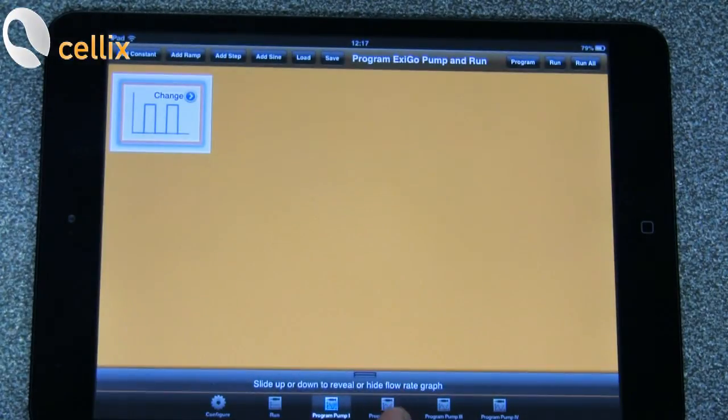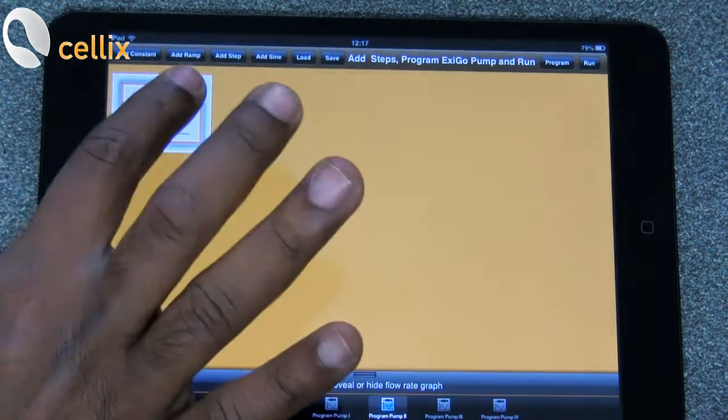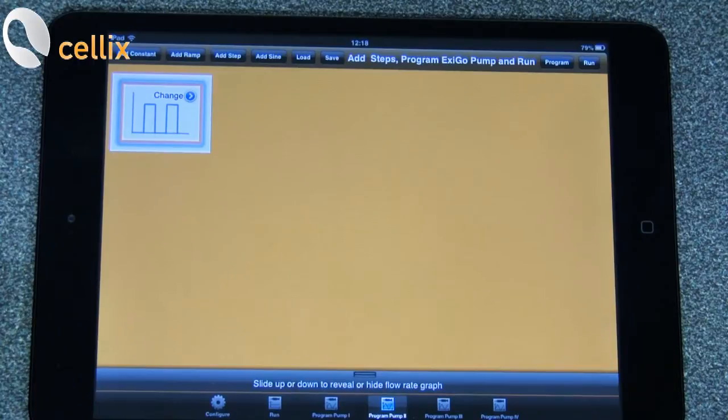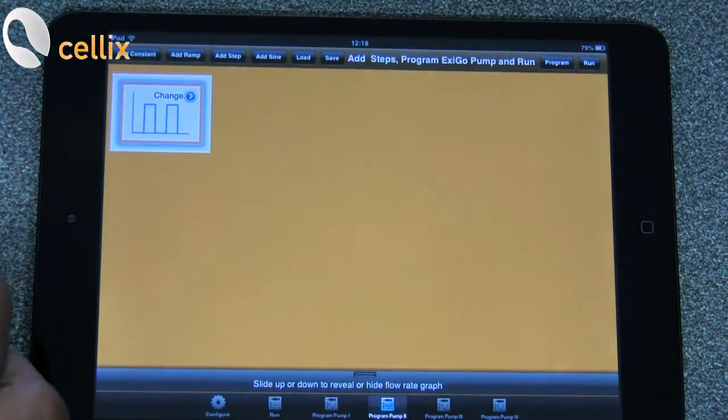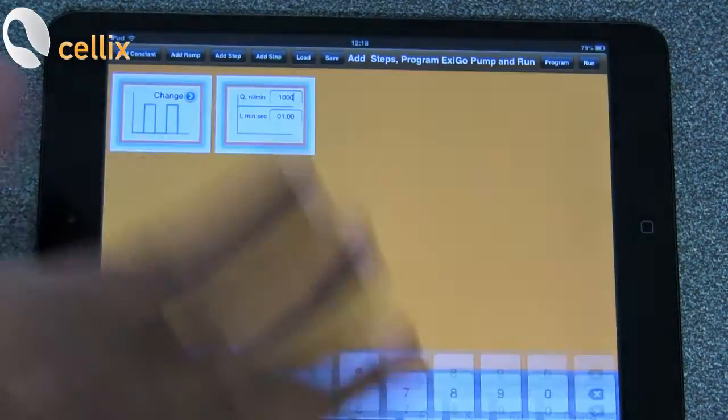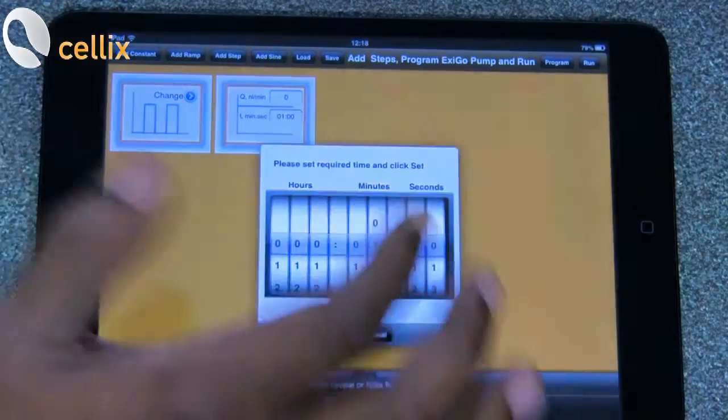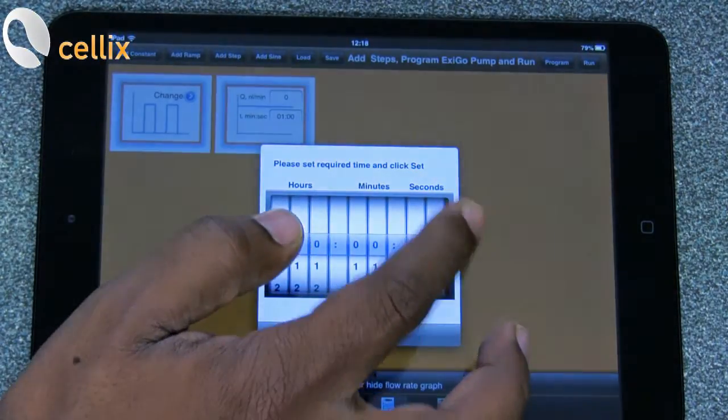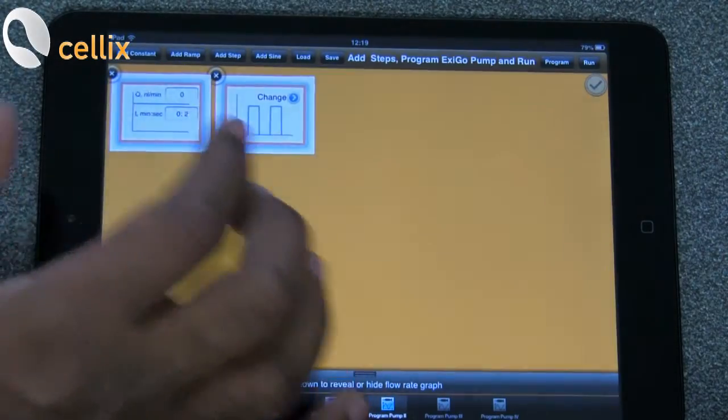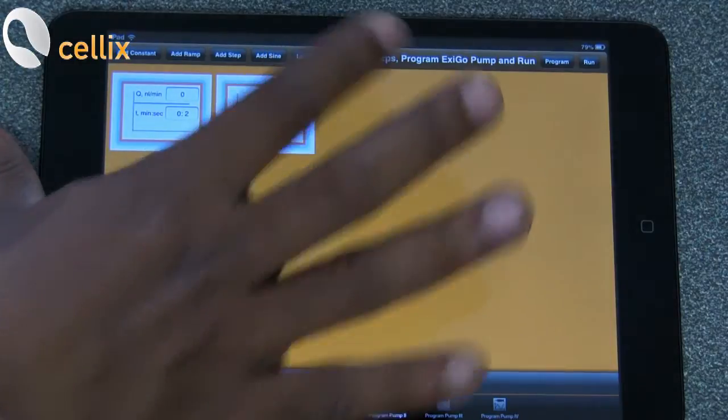And to program the second pump, you go to second pump, you click load. So you have the same parameters there. Since the second pump needs to have a delay of 2 seconds, you have the option for add constant flow where you put 0 nanoliter per minute for 2 seconds. And click. So you can save these parameters with the save option.